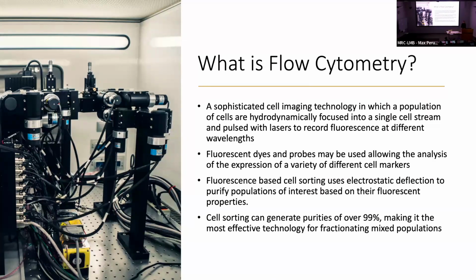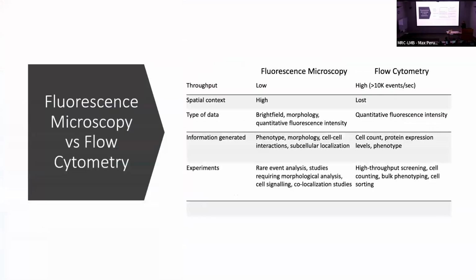And so I'm going to try now to essentially cover the main points where fluorescence microscopy differs from flow cytometry, and Nick is going to go afterwards into more detail about this. But essentially, the thing that you need to understand here is that the decision to use flow cytometry, which again measures mean fluorescence intensity, or imaging needs to be driven by your specific biological questions. So always think about that. The two technologies are not in any kind of direct competition. In fact, they're rather complementary.